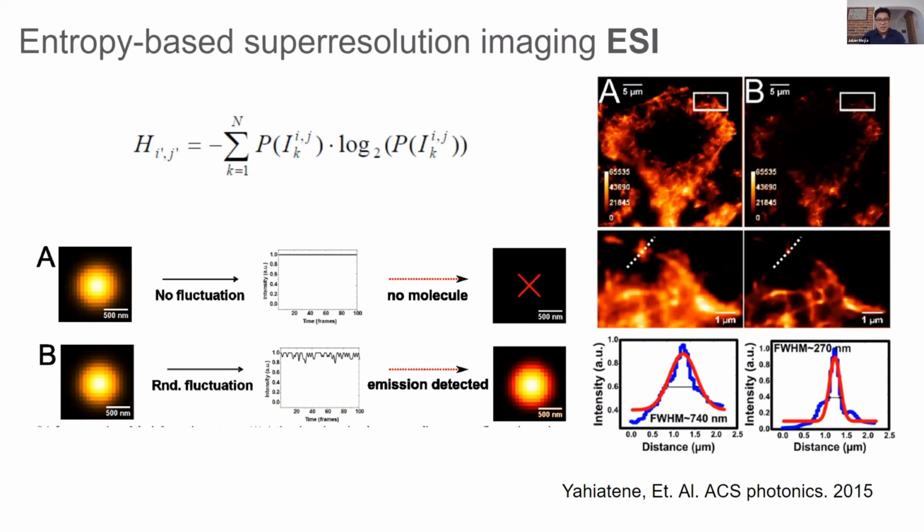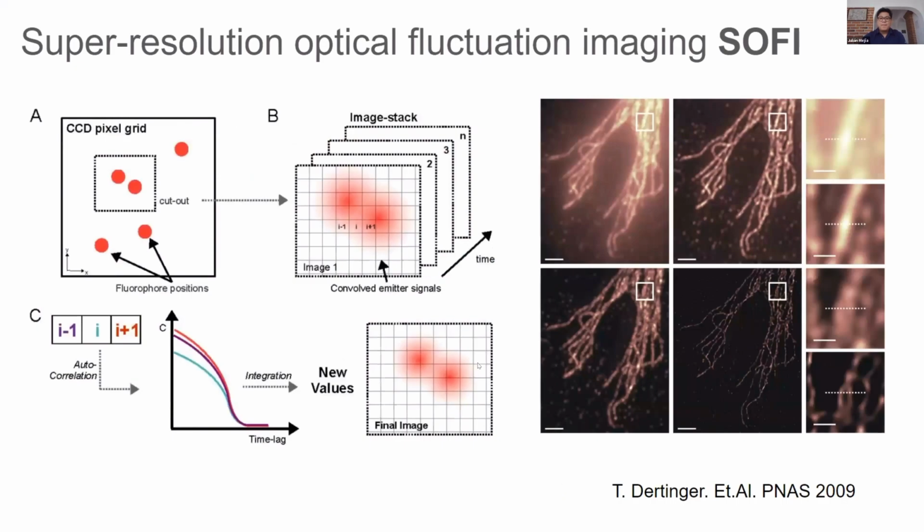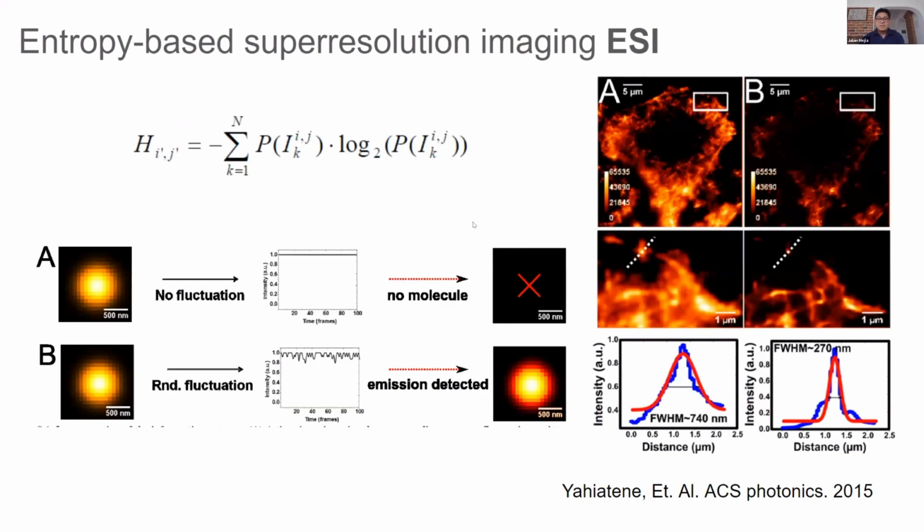In addition to that, entropy is also used to do the integration along the time. So you can see that it is the same equation, the same concept applied for 3 different features to process the images, which I think is beautiful. Unfortunately, it doesn't provide really outstanding results, at least compared with other methods. But yes, you can have a really good improvement in the resolution.